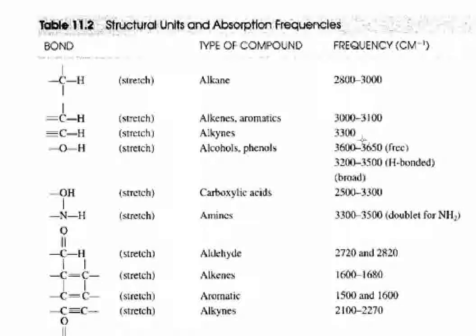The next entry is the hydroxyl group, as found in alcohols and phenols. This is the OH stretching frequency. Now, generally speaking, the average for the OH stretch is about 3500 wave numbers. This table shows that there can be variation, and indeed there can be. Hydrogen bonding will tend to lower the observed frequency.